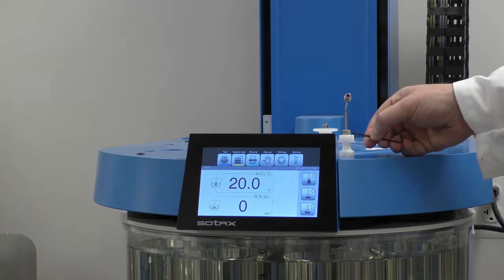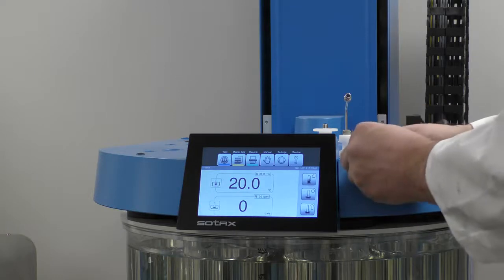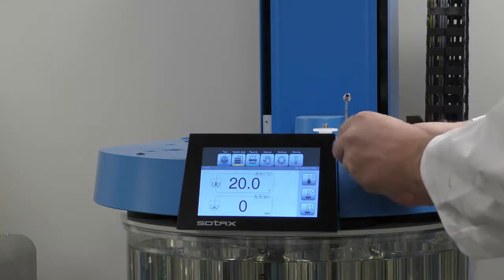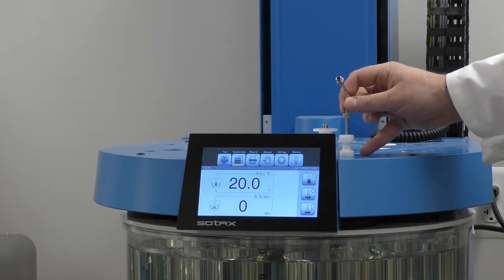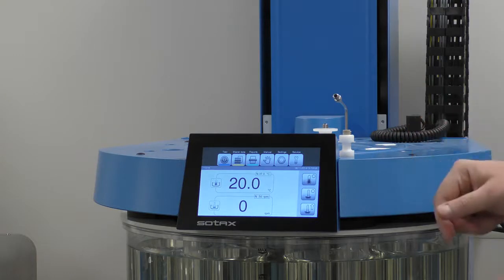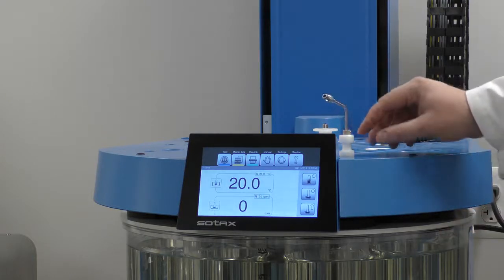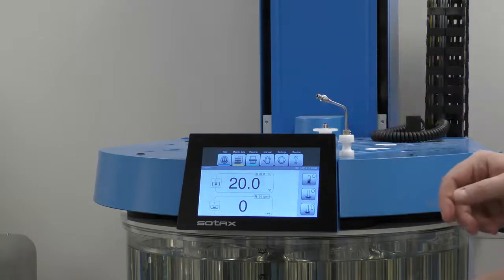There are collars on here that come preset to either 500 or 900 milliliters for paddles — so that would be 900, and that's 500 for paddles. If baskets are being used, you may have to slightly adjust these collars to match the appropriate sampling position.